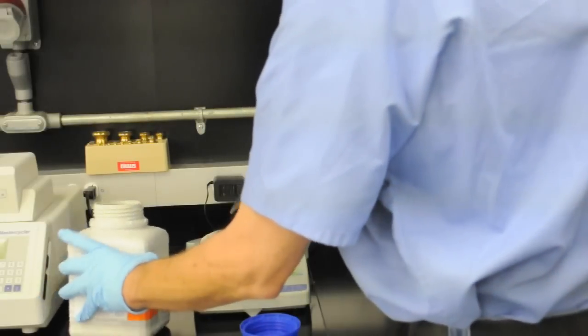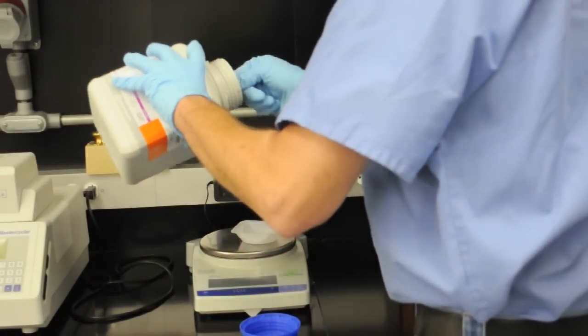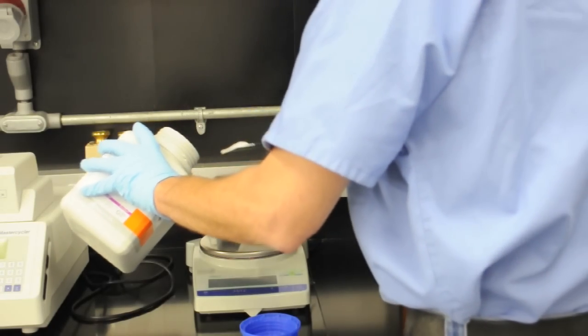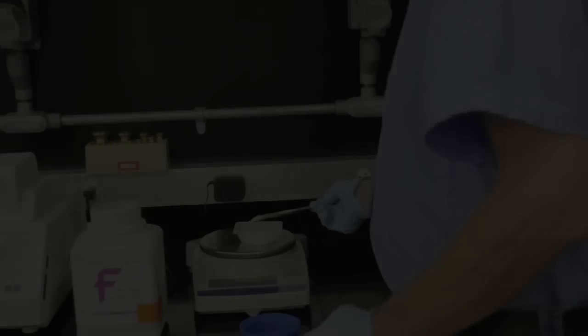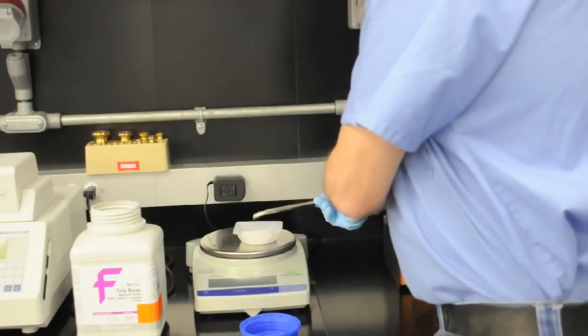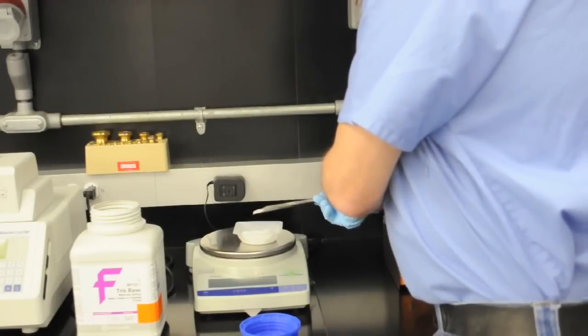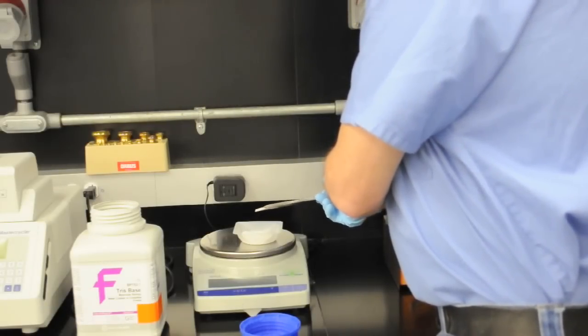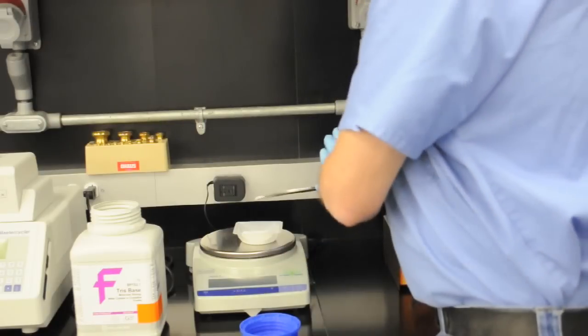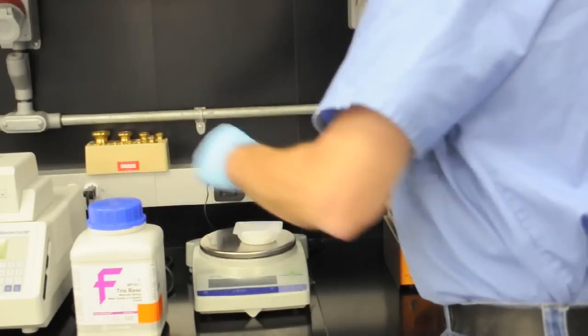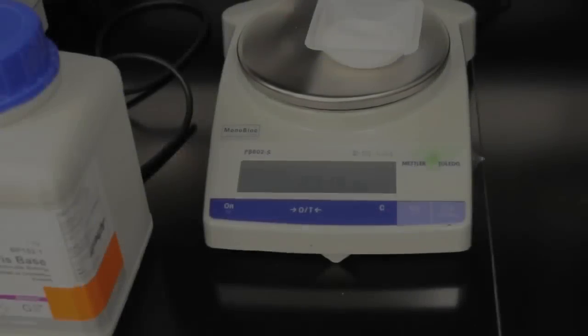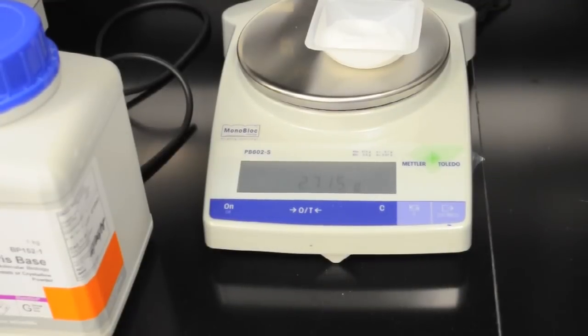Now we start transferring the solid tris base with the spatula. You want to take care not to spill it onto the balance because anything that gets spilled on the surface has to be cleaned up. When you get close to the final end point, it's useful sometimes to tap small amounts of it onto the weigh boat and discard anything that's not used. There you can see the balance is nice and stable exactly on the amount called for in the SOP.